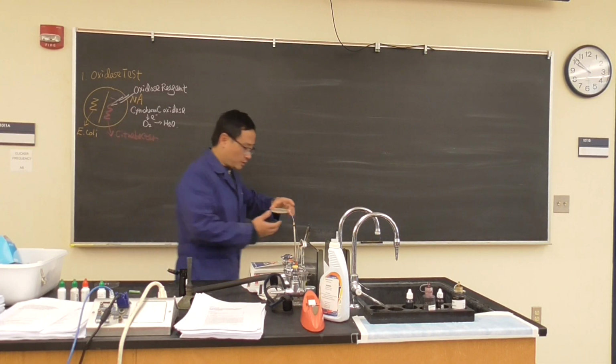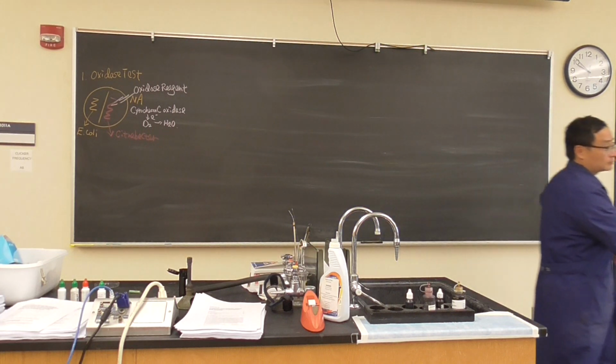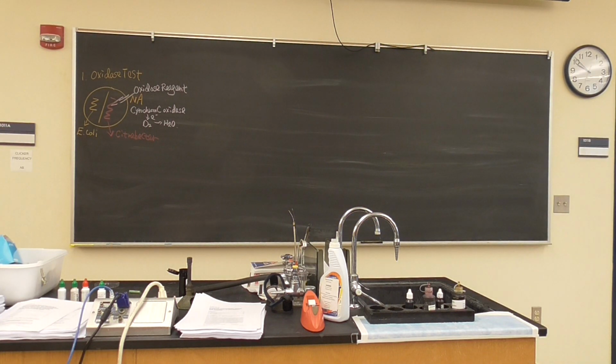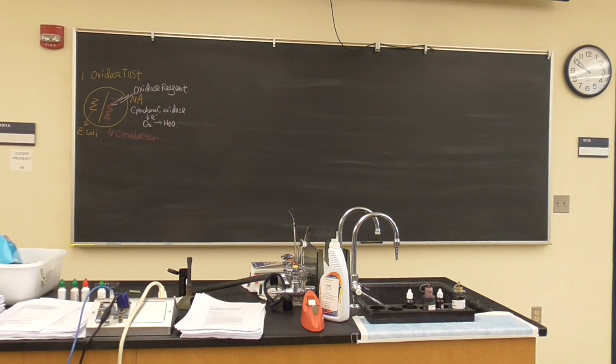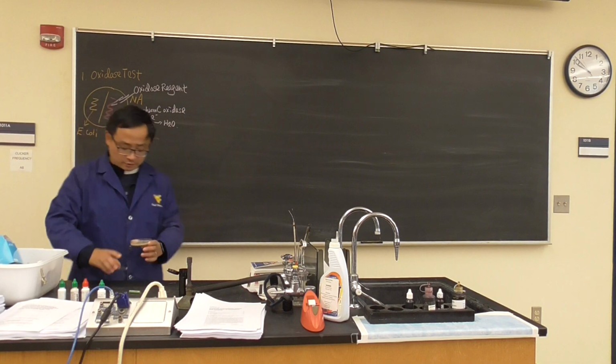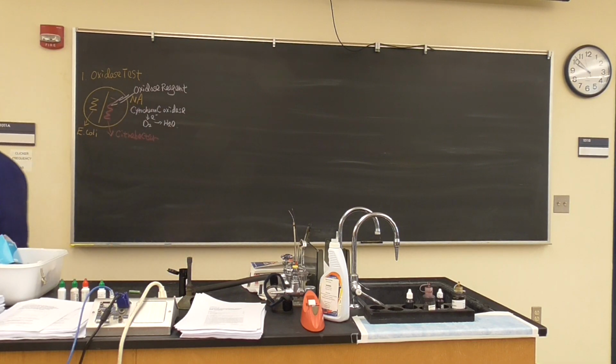But you can see what a positive looks like. That's what a positive is supposed to look like. That's what the oxidase test looks like.